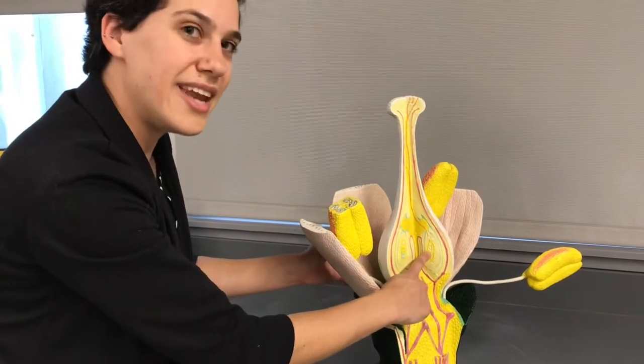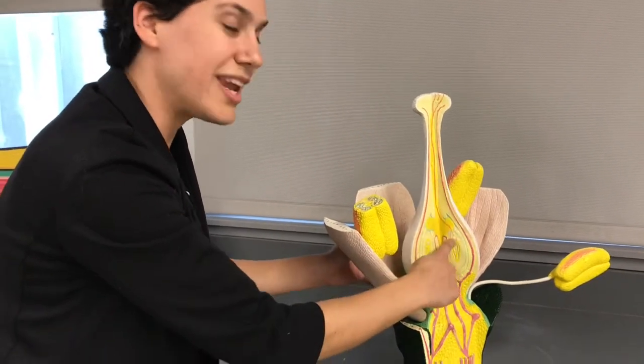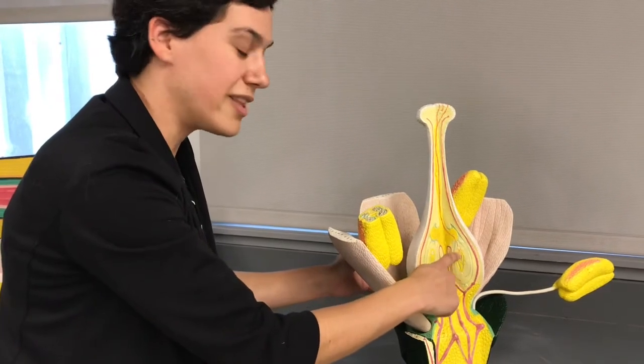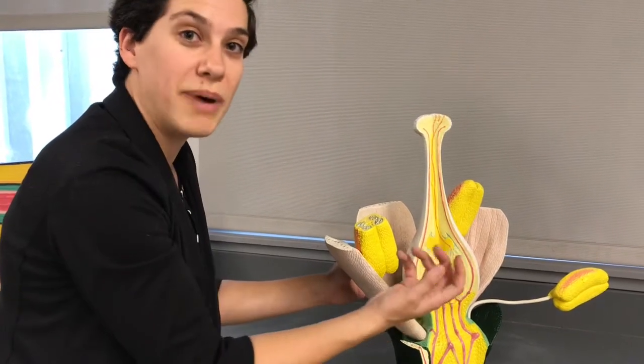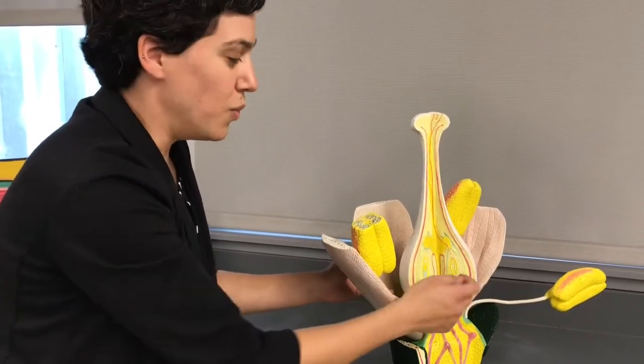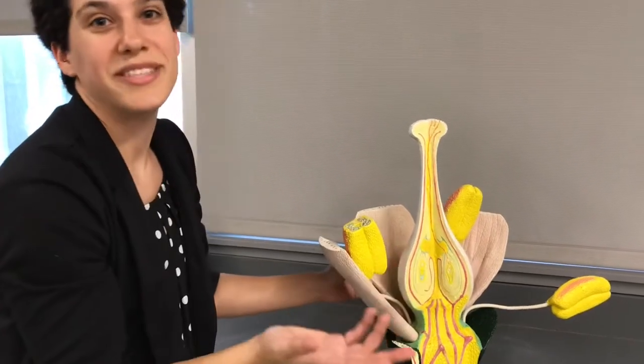That ovule has an egg inside. And the pollen has a sperm inside. When the sperm from the pollen and the egg from the ovule combine in fertilization, we can get a fertilized ovule, which will become a seed.